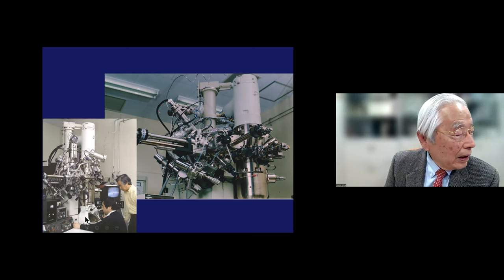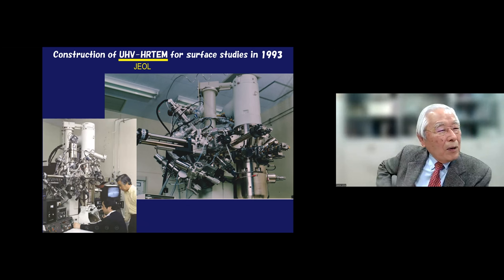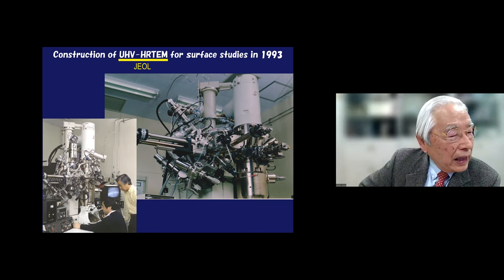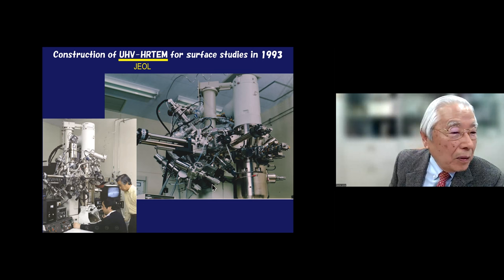I built this one. At that time, ultra high vacuum microscopes were already built by JEOL also, but only for diffraction work. Professor Takayanagi used the ultra high vacuum microscope for diffraction, but not as a high resolution microscope. So I built this one, and I will show you some of the pictures.